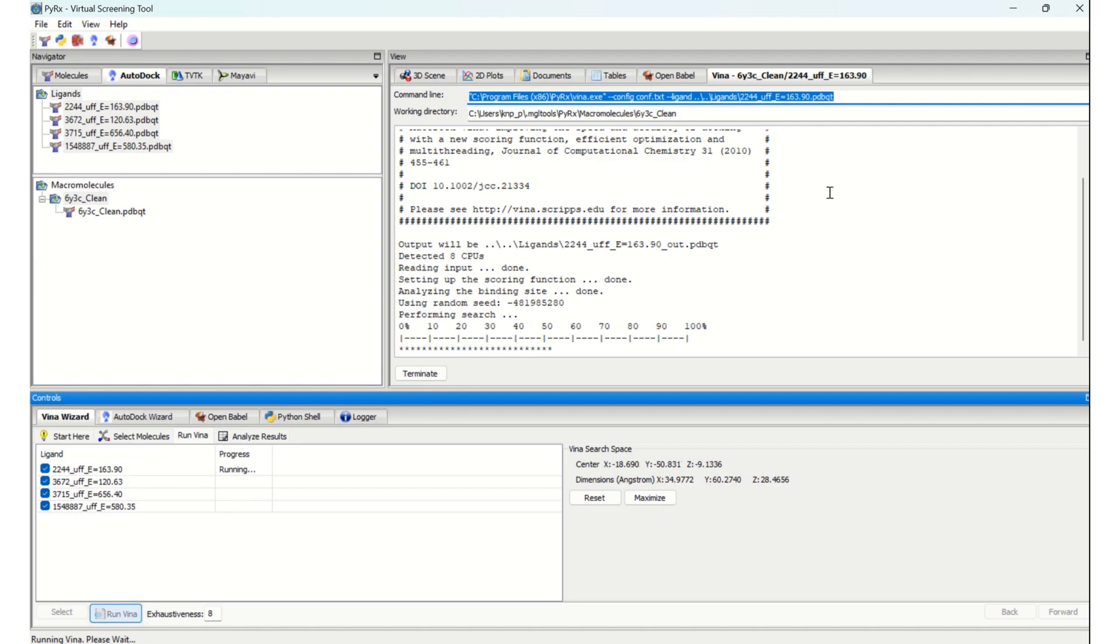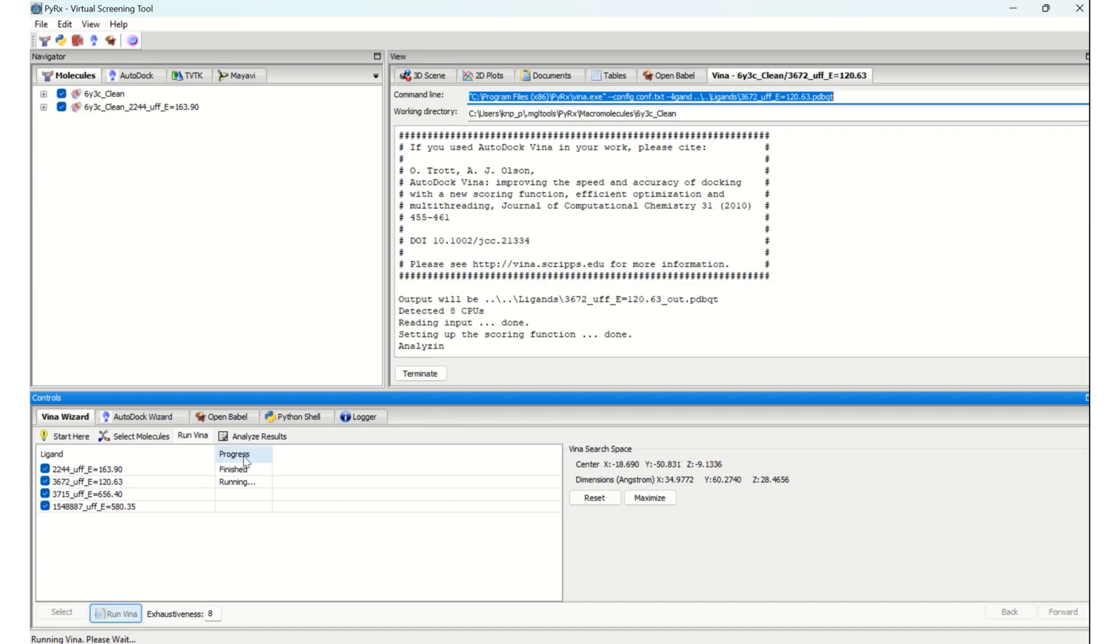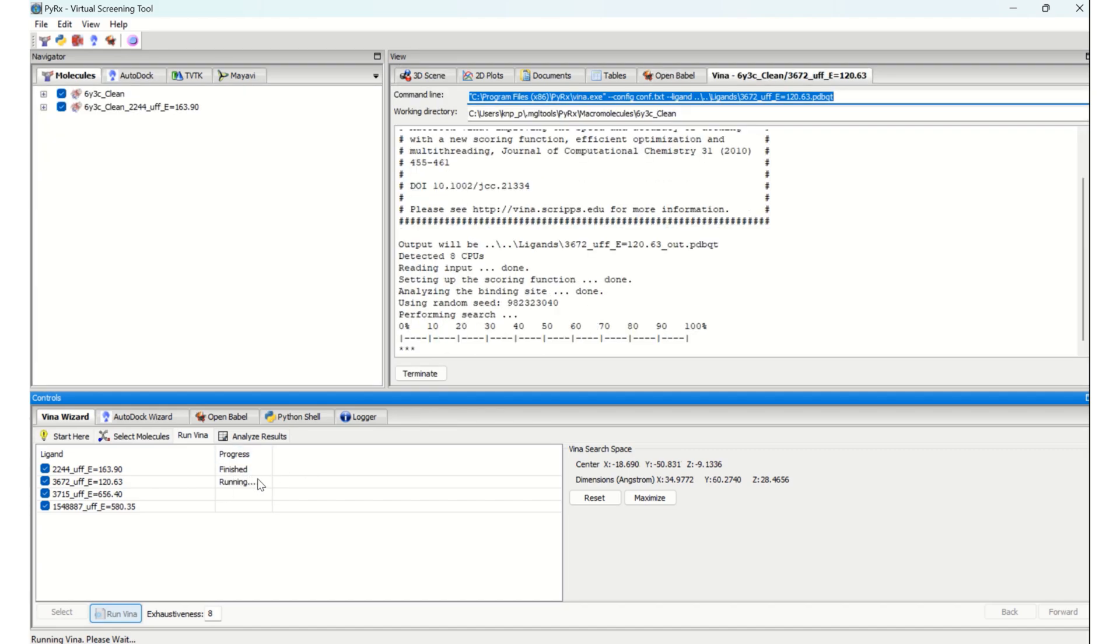The first ligand has finished, and the second ligand has started.